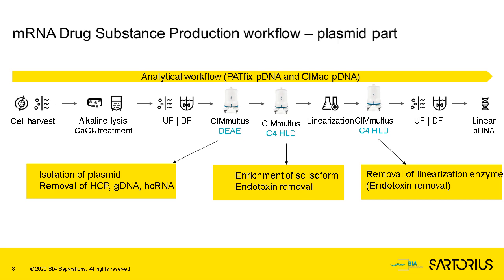And this is namely weak anion exchanger, diethylamine ligand, that works very well in the processes, is extremely well understood and templated, let's say, for a whole host of plasmid sizes. And you can purify plasmids up to 10, 15 kilobase pairs using process steps that are prescribed.